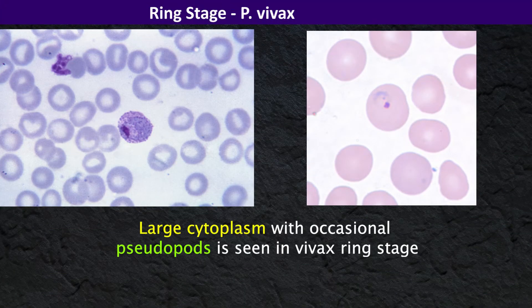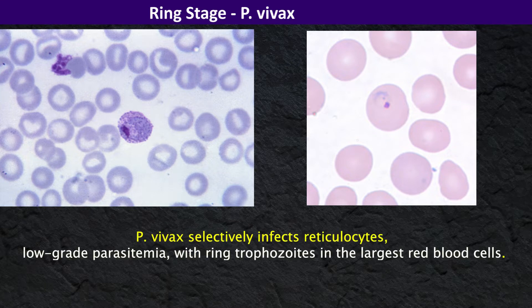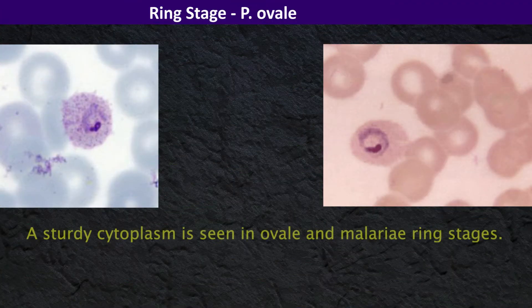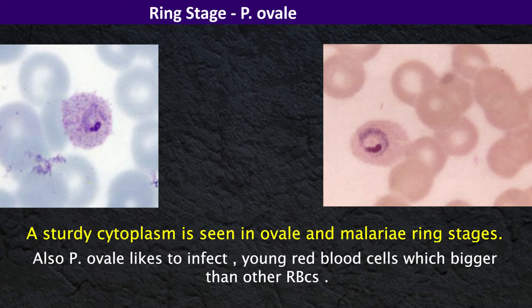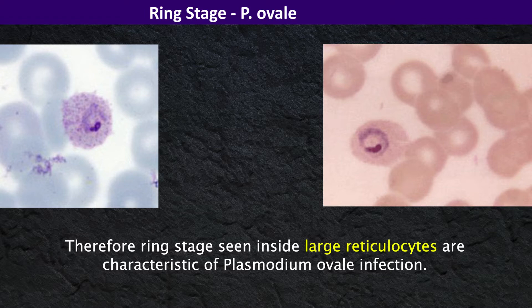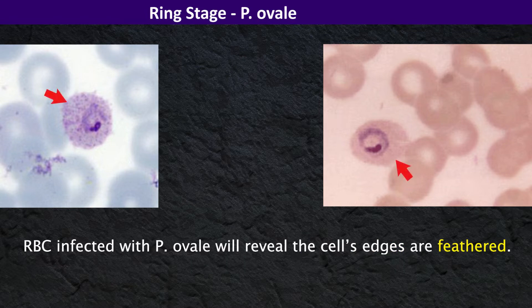Large cytoplasm with occasional pseudopods is seen in the vivax ring stage. Remember, Plasmodium vivax selectively infects reticulocytes; therefore, we would expect to see a low-grade parasitemia with ring trophozoites in the largest red blood cells. A compact cytoplasm is seen in ovale and malariae ring stages. Plasmodium ovale likes to infect young red blood cells which are bigger than other red blood cells; therefore, ring stages seen inside large reticulocytes are characteristic of Plasmodium ovale infection. Red blood cells infected with Plasmodium ovale will reveal that the cell edges are feathered.